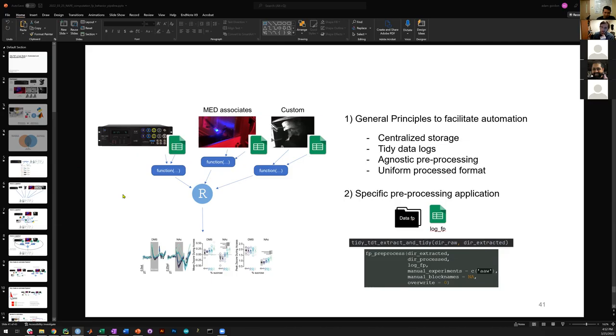Yeah, with two-photon data it's the same way. The data sets are really large, and there's not much you can do about it.